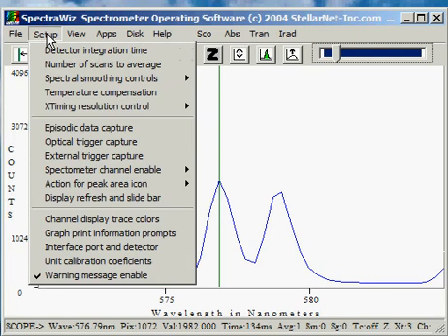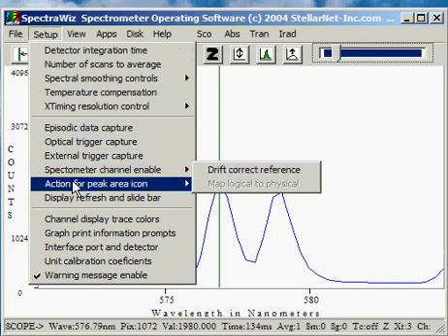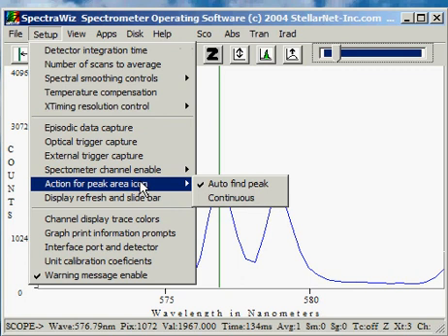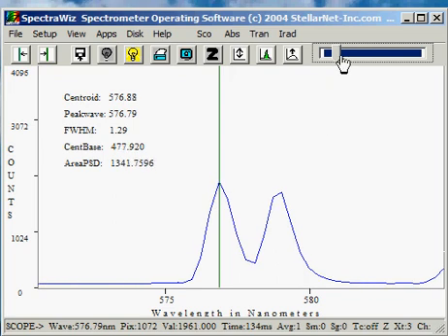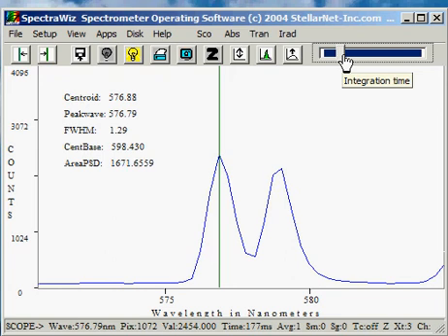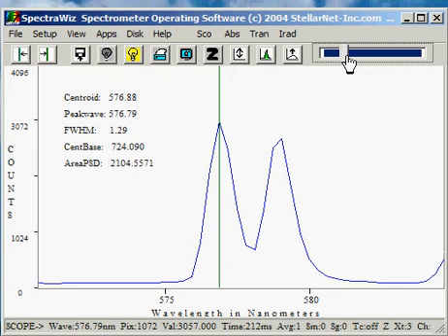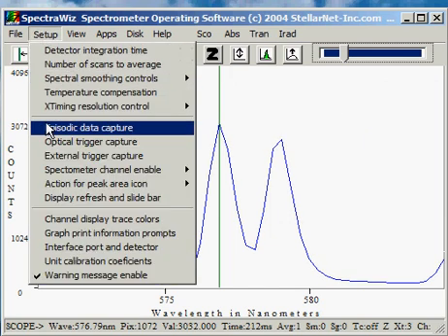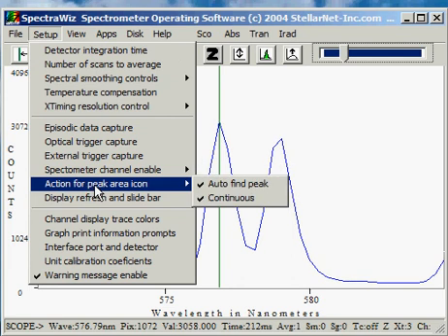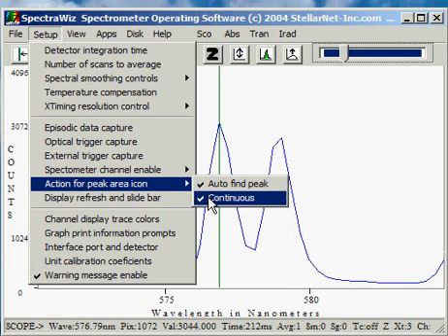On the setup menu, I can select how this icon reacts so that it will auto-find next peak or perhaps continuous. In continuous mode, it continually evaluates and reruns. For example, if I increase the detector integration time, I can see the effects of the area PSD increase due to the area under this peak being changed by the longer integration time. I can disable the feature for the peak area icon from continuous back to snapshot.